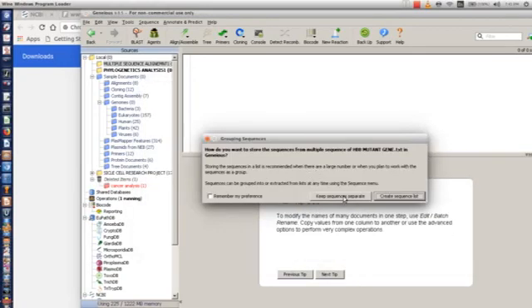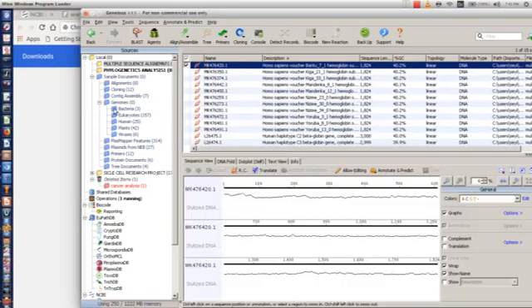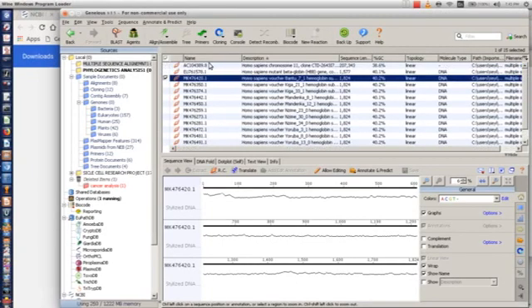then you keep sequence separately. Yeah, so you have all what you actually downloaded here.